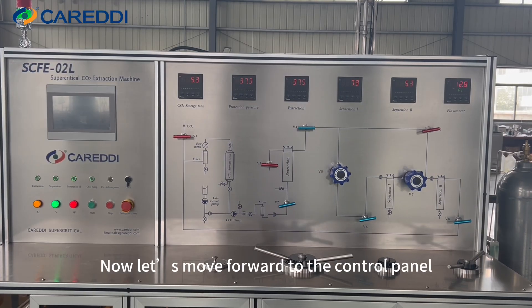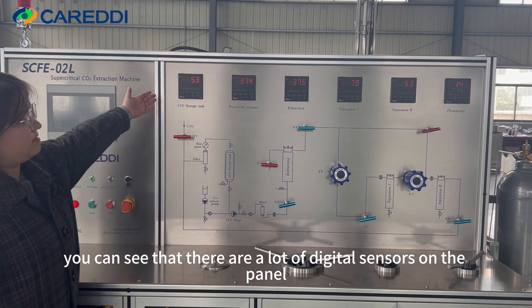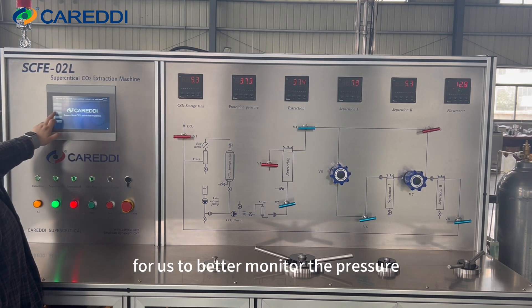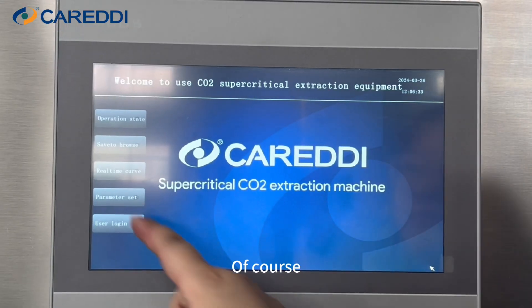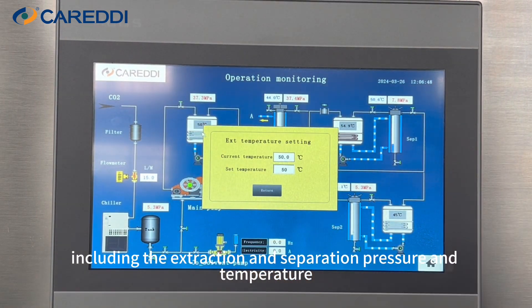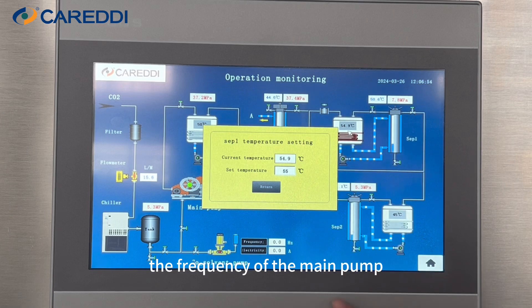Now let's move forward to the control panel. Right now we are cleaning this machine. You can see that there are a lot of digital sensors on the panel. They can show real-time CO2 flow and pressure for us to better monitor the pressure. You can also use the control system via the screen to check more detailed records, including the extraction and separation pressure and temperature, and the frequency of the main pump.